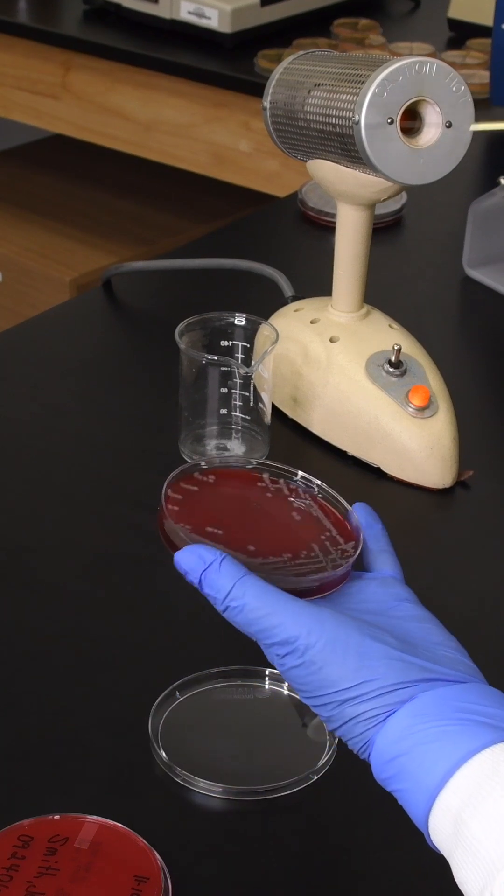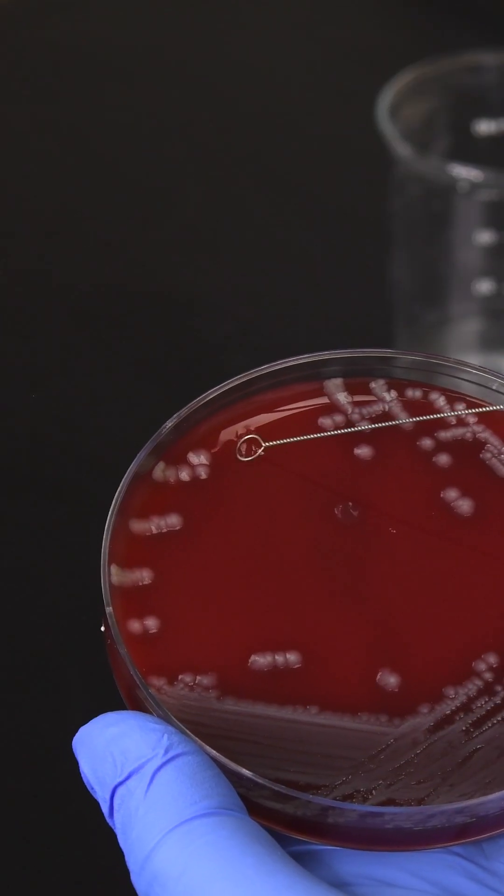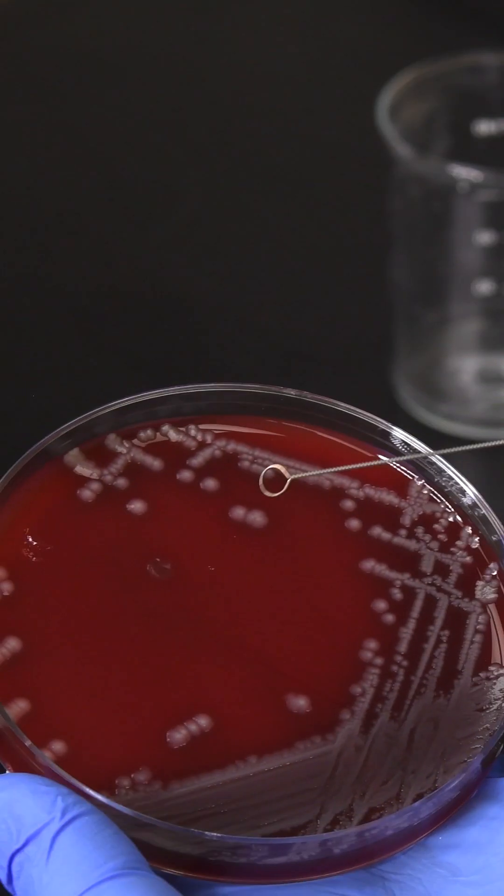Cool the hot loop by touching it to a sterile area of the petri plate. Depending upon the sample type, use the loop to collect a small number of cells from confluent growth.